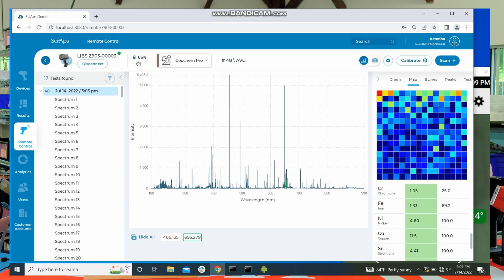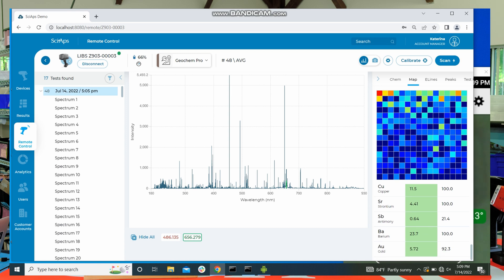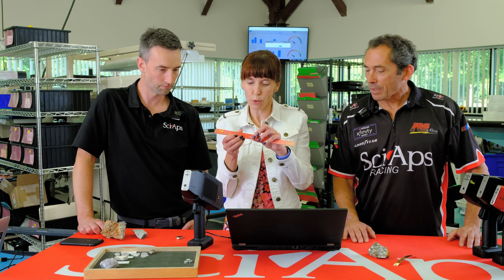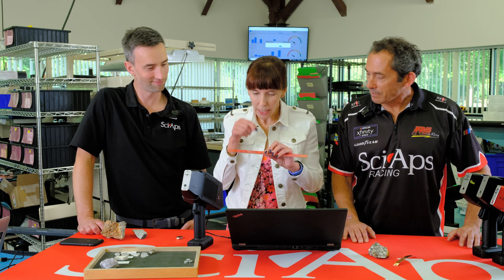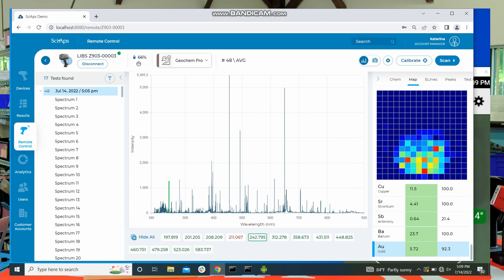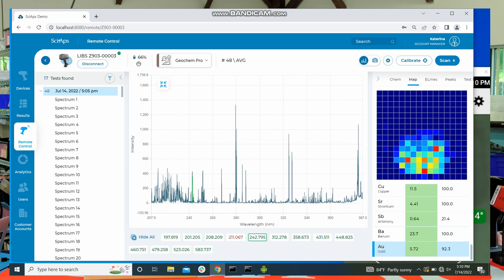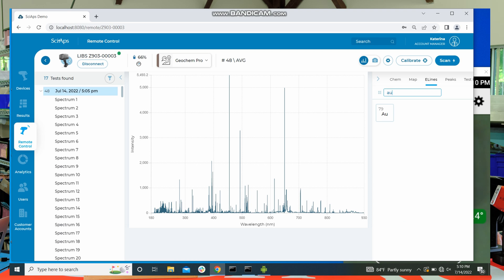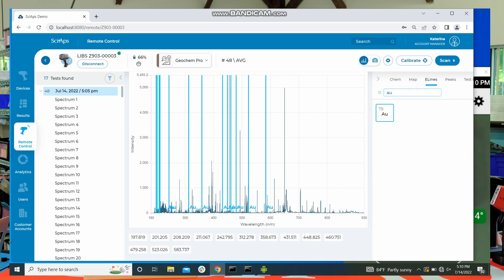The main feature is the heat map, where you can select a particular element and get a heat map presentation of it. This ruler has a tiny 300-micron spot of gold and we hit exactly that spot. This is the gold we're hitting and this is the area that didn't have anything. You can also see emission lines and zoom in on a particular area of the graph. You can choose your element and see where the lines are — look at all those gold lines.